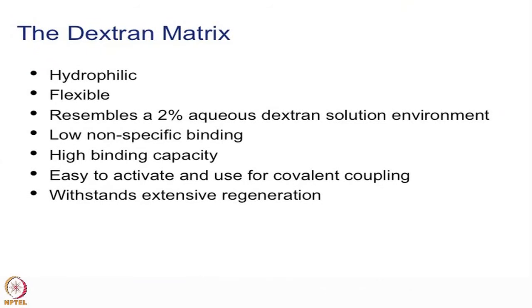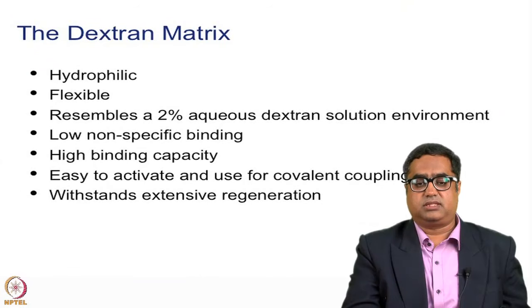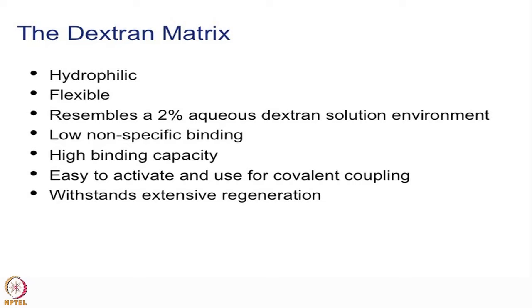Looking at this gold surface, the major component attached to it is the dextran, and it is very important to understand why dextran. Dextran is hydrophilic, dextran is flexible, and dextran resembles a 2% aqueous solution. It has very low non-specific binding and a very high binding capacity, is easy to activate for covalent coupling, and withstands extensive regeneration. Now, let us go into the different available chips.